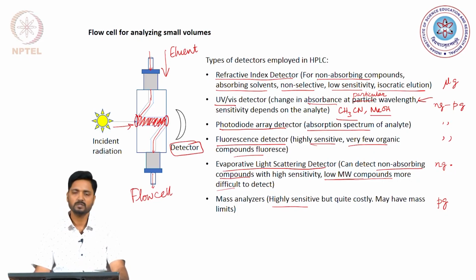So, with this we come to an end to this lecture 1 of week 11 for this course. In the subsequent lectures of this week, our efforts would be directed towards gaining understanding on how gas chromatography works, how supercritical fluid chromatography works, and what are the detectors that are available for these techniques.